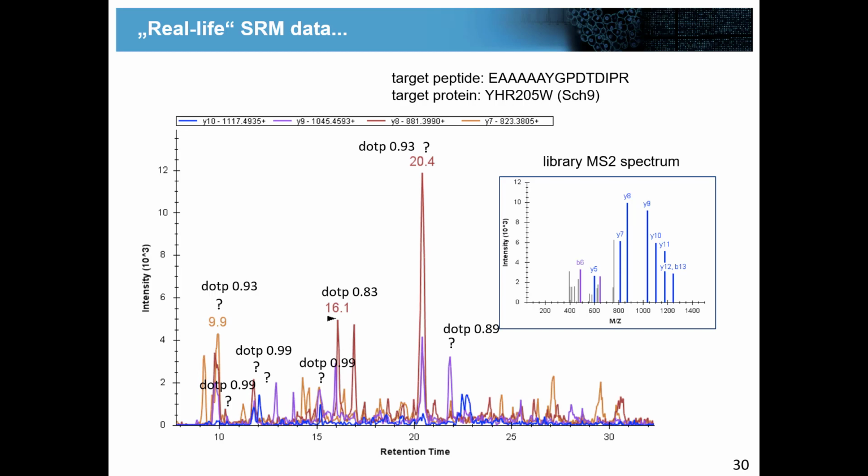Yeah? You have a proline in the sequence. Mm-hmm. So those are normally the most intense ones. Yeah, but it's the Y1. No, there's another one. Yeah, could be a Y5. So, I mean, you see it here. This is the spectrum, right? There wasn't one transition that was crazy different in this case. So by just taking a spectral library as additional information, in that case, not enough. The dot p is not good enough.